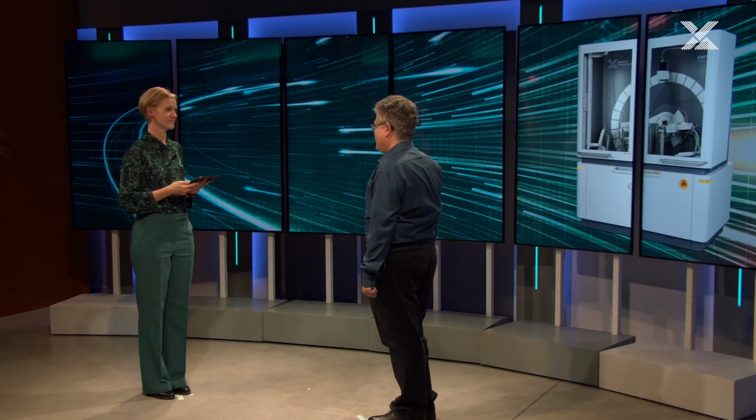We just talked about powder X-ray diffraction. Today we're going to talk about scattering techniques, and apparently humps have information. Explain. Exactly. Well, basically, when I started up in 1995, the expectation was low background, good peaks, and then you have a good sample. And if you had something with a hump-like pattern, you had a bad sample, please come back when you got a good one. Oh, so you expected something flat? Yeah. So it was literally a technique reserved for very nice and crystalline materials and good samples, and all the rest was discarded.